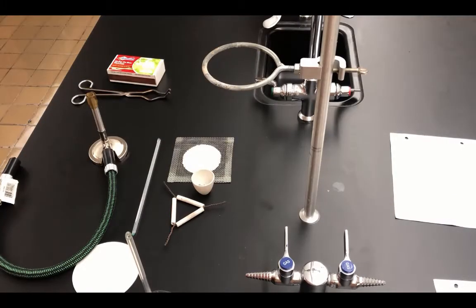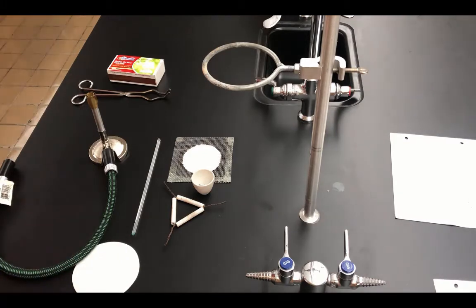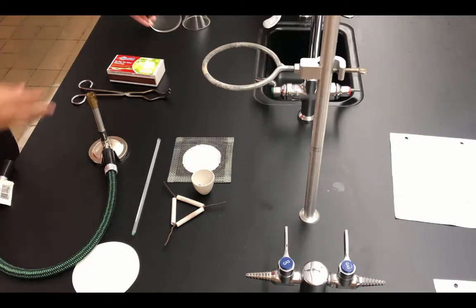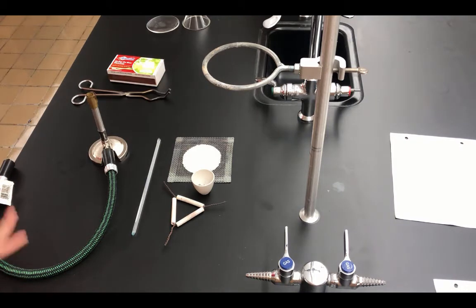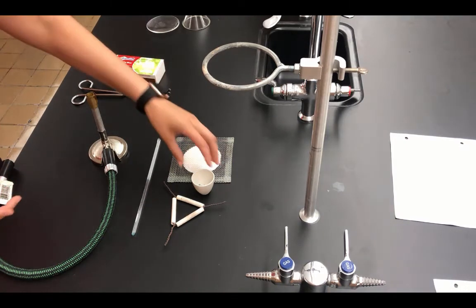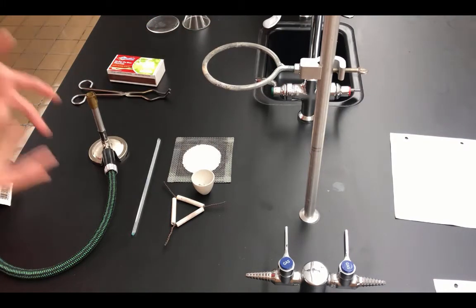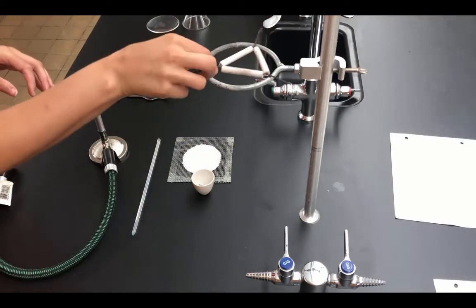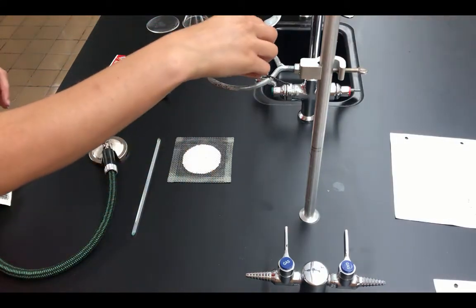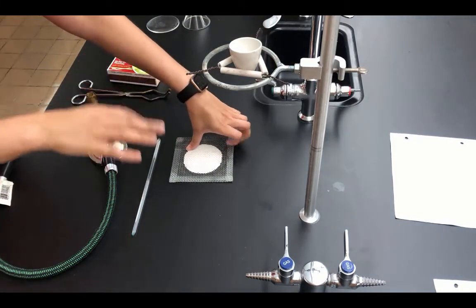You will see right now I have all of the materials out that we will need for this lab. We will not need the filtration materials yet, so I'm going to set those off to the side. What we're doing first in the procedure is heating a crucible. When you are setting up a heating of crucibles, you want to use an iron ring and a clay triangle, and then you will put the crucible right inside the clay triangle, so it will rest inside the clay triangle.